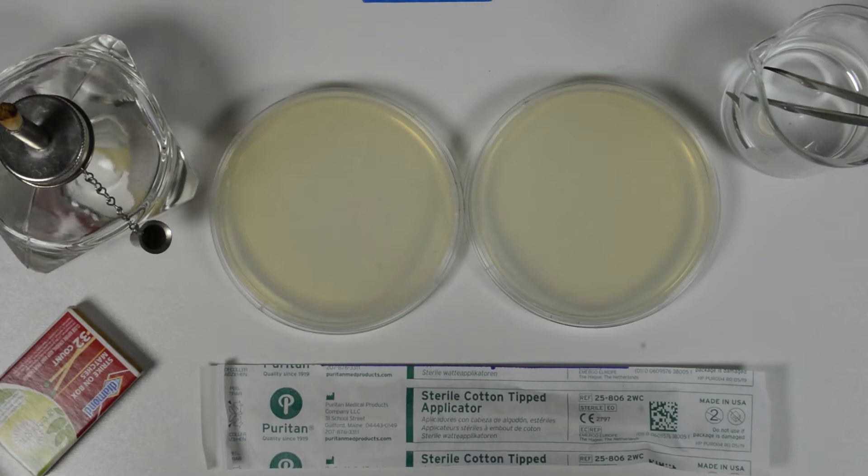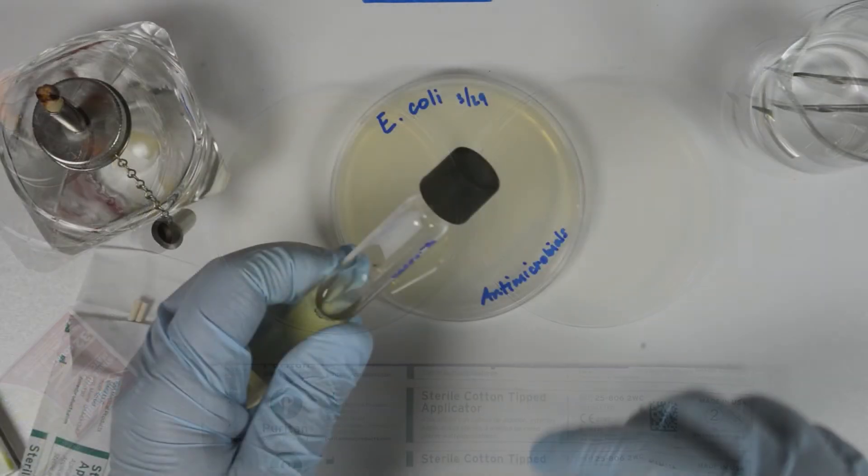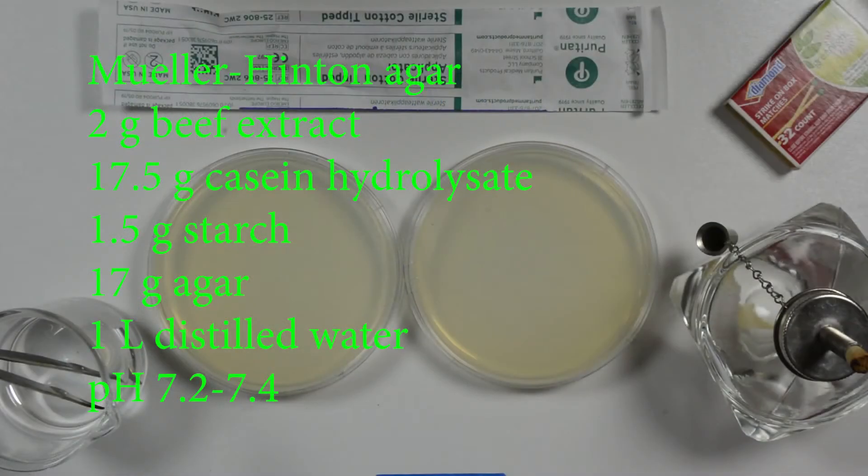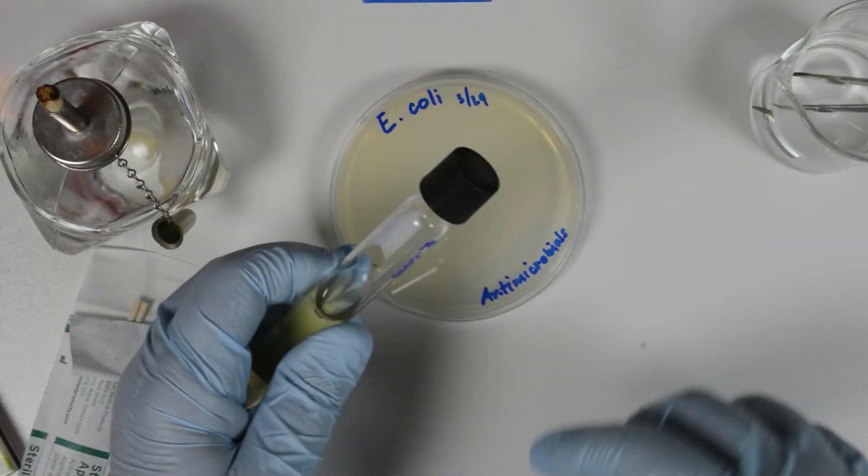We will follow the standardized procedures for this setup to ensure reliable results. We begin with a pure culture of a bacterium that we will inoculate onto the agar plate containing 4 mm deep of Mueller-Hinton culture medium. There is one standardized way to inoculate the plates according to the American Microbiological Society. We use a broth culture diluted to match a 0.5 McFarland turbidity standard to inoculate the plates.